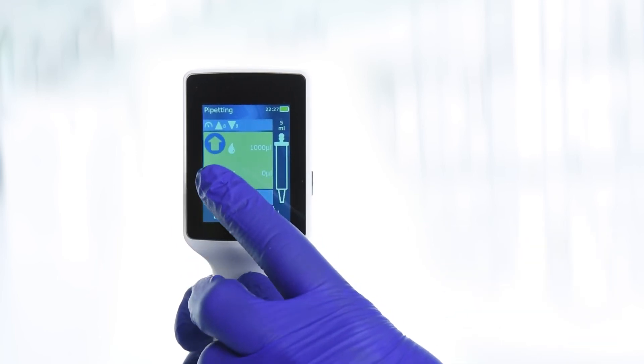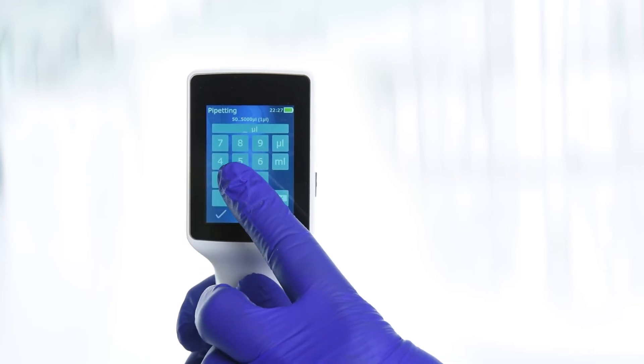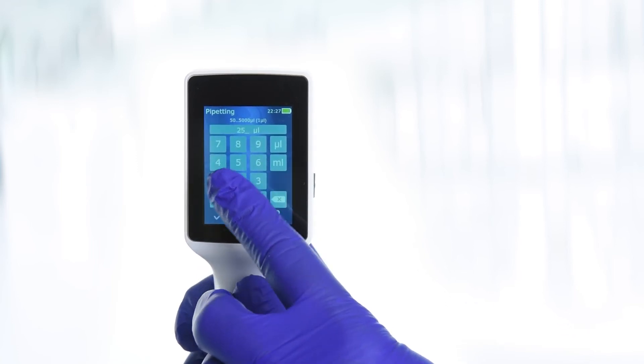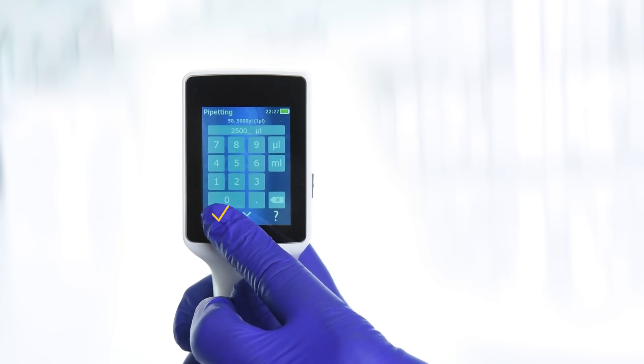To set the desired dispensing volume, tap the water droplet icon. Type in the desired dispensing volume using the keypad. Then tap to confirm.